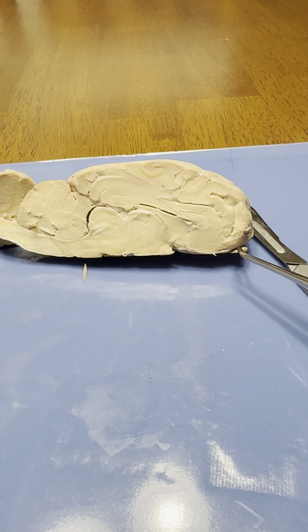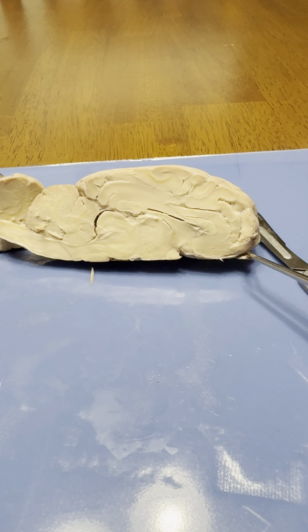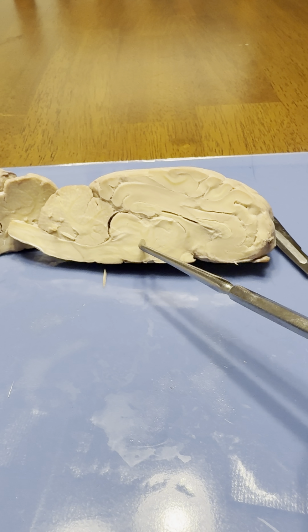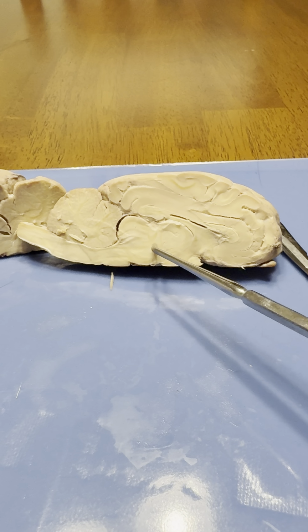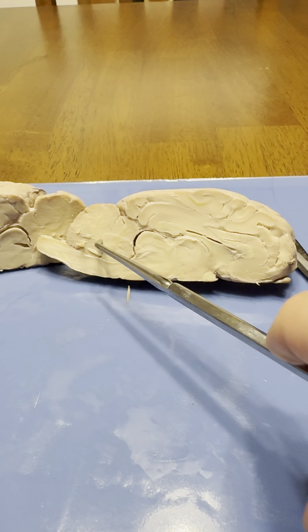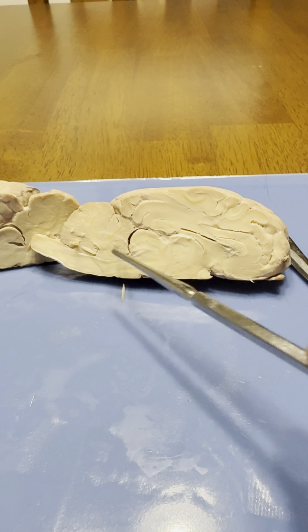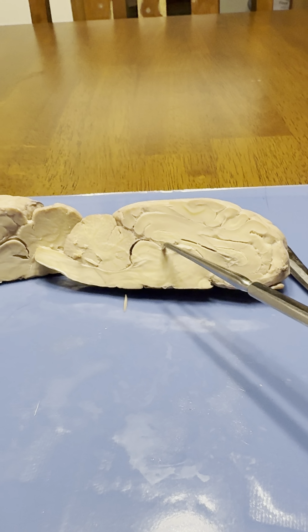Right here is the olfactory bulb, which contains cell bodies of neurons. And then you have the thalamus, which serves as a sensory relay center. And then you have the cerebellum, which controls balance and muscle coordination. And then over here, you have the pineal gland, which secretes melatonin.